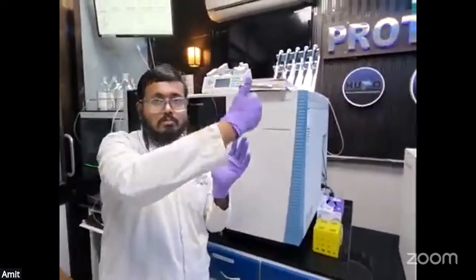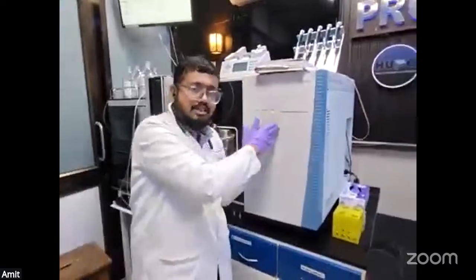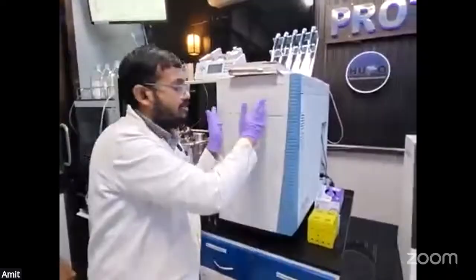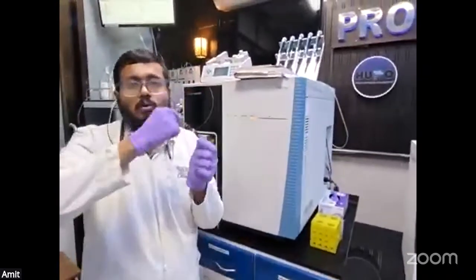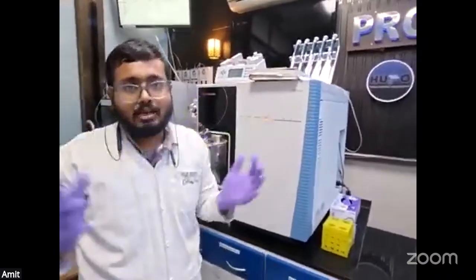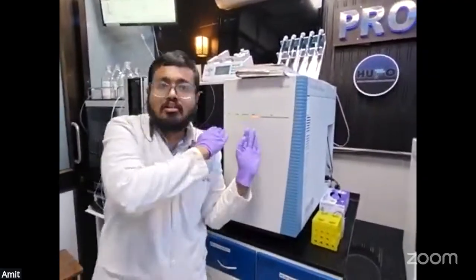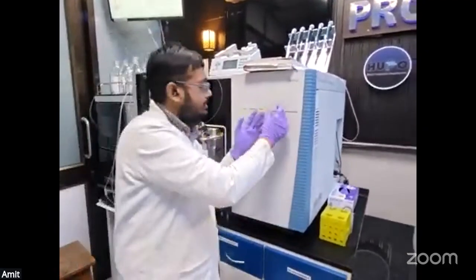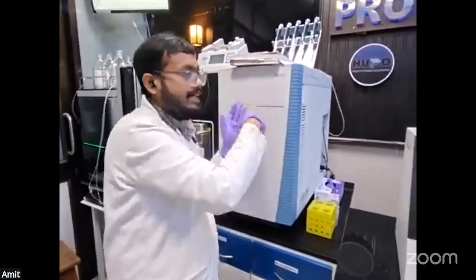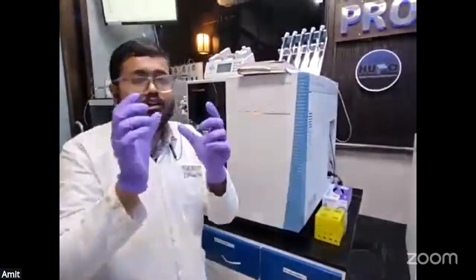So we have already spoken that the quadrupole contains the filtering of the precursor ions. Now there is a collision cell in between, and there is a third quadrupole. So how we generally give this kind of instrument, because you cannot collect whatever is present in your sample in a global way. Rather, we have to give the precursors that will be filtered out in the first quadrupole, as well as the product ions after the collision cell that we are getting to identify in the third quadrupole.